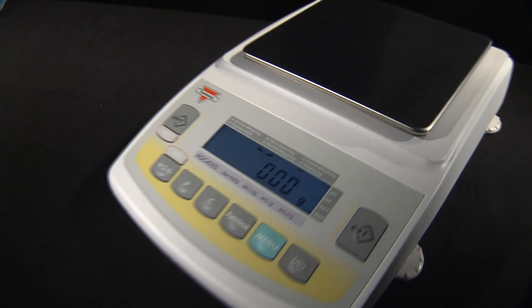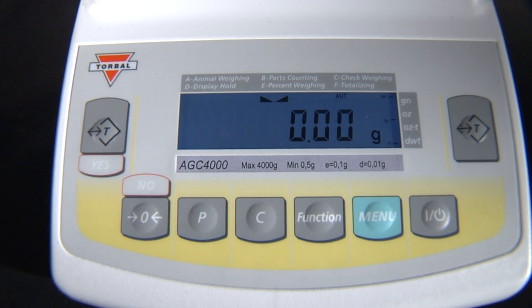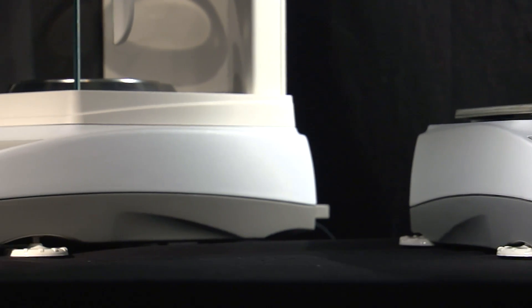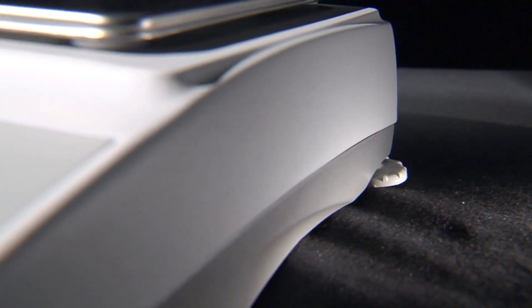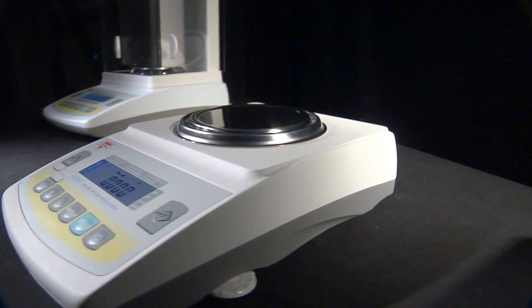The precision models range in capacity from 100 to 500 grams with a resolution of 1 milligram, and 1,000 to 4,000 grams with a resolution of 1 hundredth of a gram. Just like the AD series, the AGC is built with a full die cast metal housing that guarantees durability and long operating life.